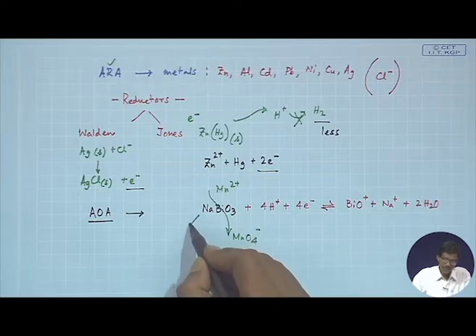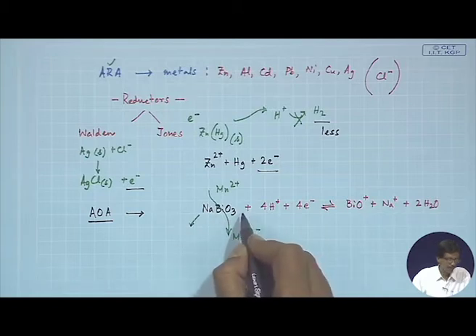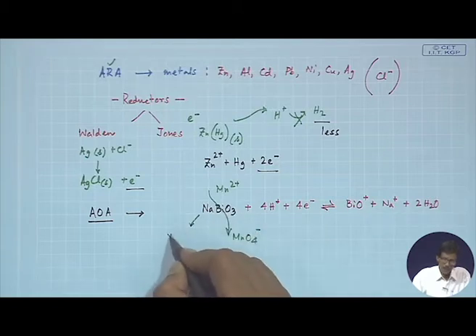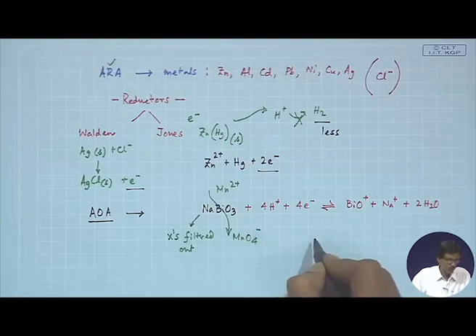We take this as a solid powder, and we boil it in the presence of this manganese 2+. When all of the manganese has been converted, you have the excess NaBiO3. This excess we can filter out to get a clear solution of MnO4 minus.